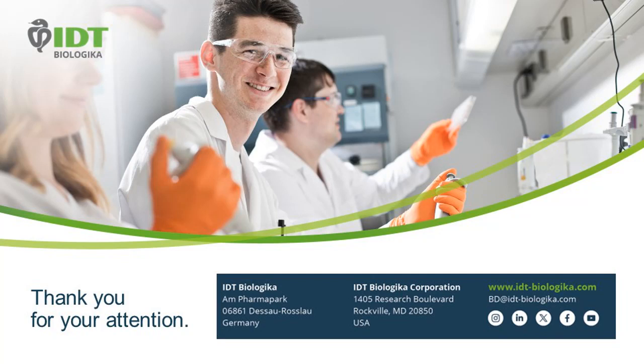Next question. What are the next steps for you to make this manufacturing process more efficient and safer? Yeah, in terms of efficiency, of course, we are trying to further reduce the cost by implementing a material supply strategy to lower the material costs at the end, and optimizing the material efforts for manufacturing. I mentioned the most cost aspects here are transfection reagents and plasmids. So there's an option here to minimize the material amounts for transfection reagent, or also for the plasmids, and also for the productivity itself. We can optimize the plasmid itself with different strategic partners with experience behind.